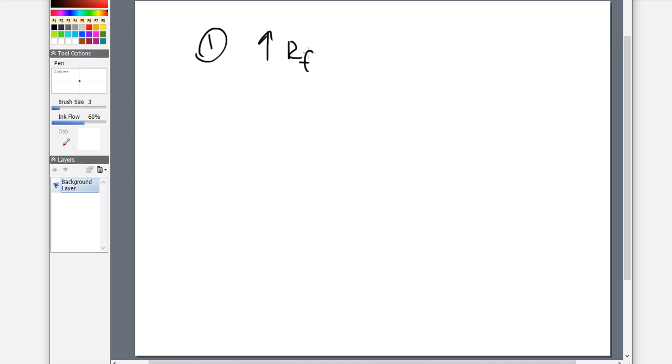So then after I put the plate inside, it's going to soak up, like a piece of paper. It's going to soak up that water or that paper towel. It's going to soak up that liquid much faster using a dry one than it is a wet one. So because it does suck things up faster, our RFs are typically a little bit higher as a result.